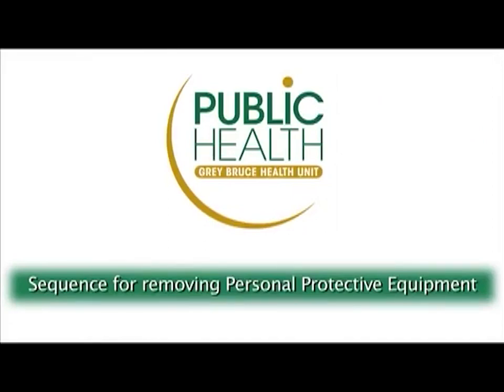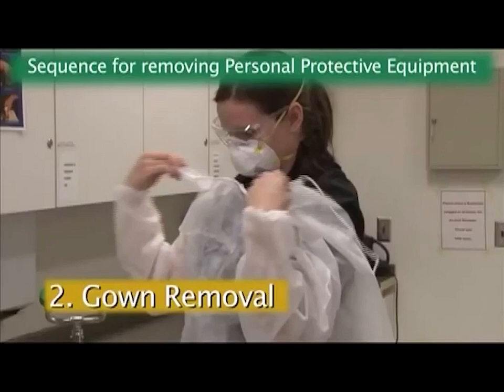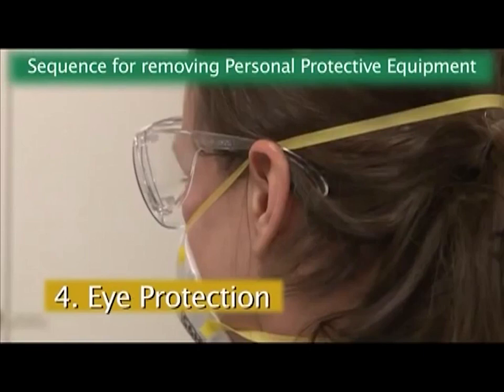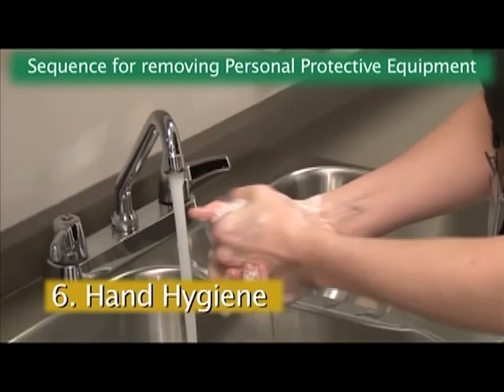All personal protective equipment must be removed in sequence and discarded carefully. Proper removal is important since equipment is now contaminated. The steps are: 1. Glove removal. 2. Gown removal. 3. Perform hand hygiene. 4. Eye protection removal. 5. Mask removal. And 6. Perform hand hygiene.